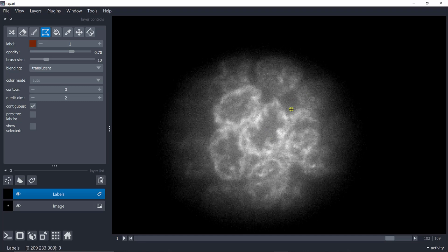So this, I'm going to do it because it's, I guess, fairly new, it didn't exist before. Yes, so that looks like what you have in QuPath, except I double click unexpectedly. So that might be better than the brush. And if you want, you can erase, of course. So I'm going to type 2. I'm going to use the brush here, and then if you want to go a bit faster, boom, 4, and I'm filling it, okay?